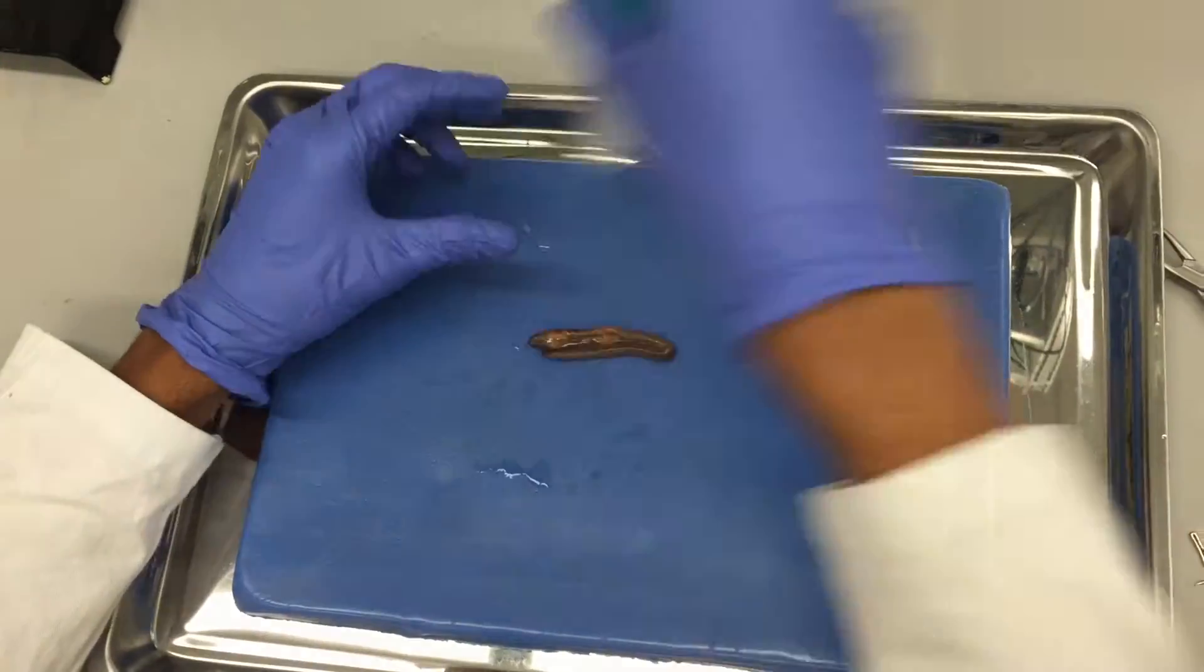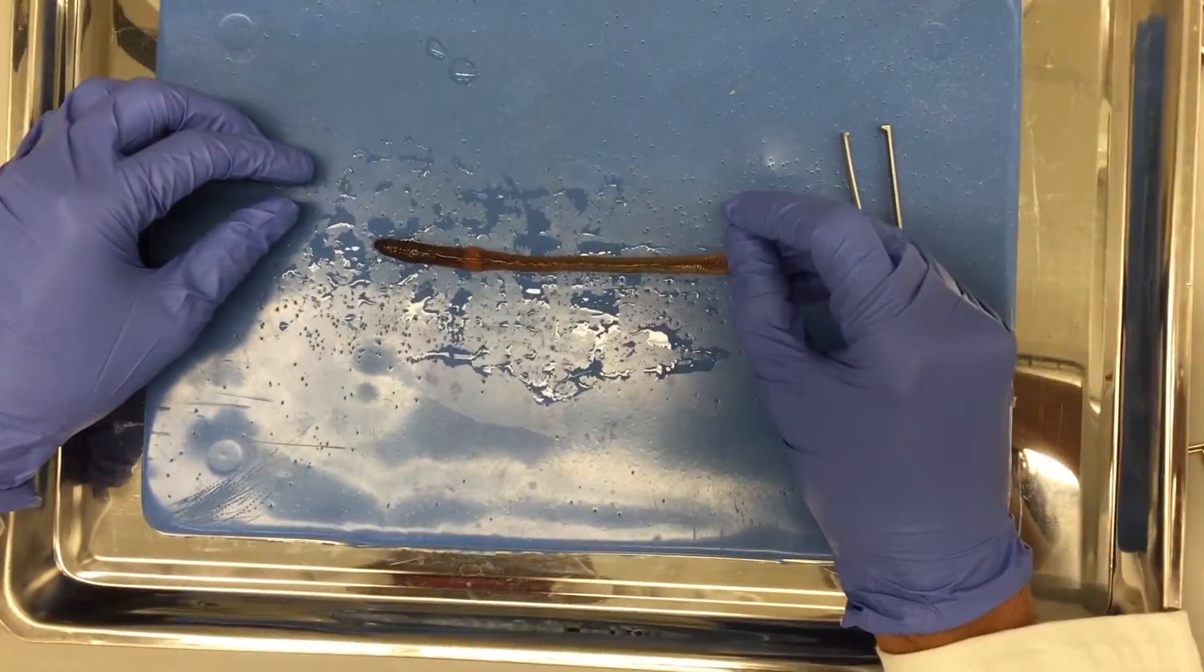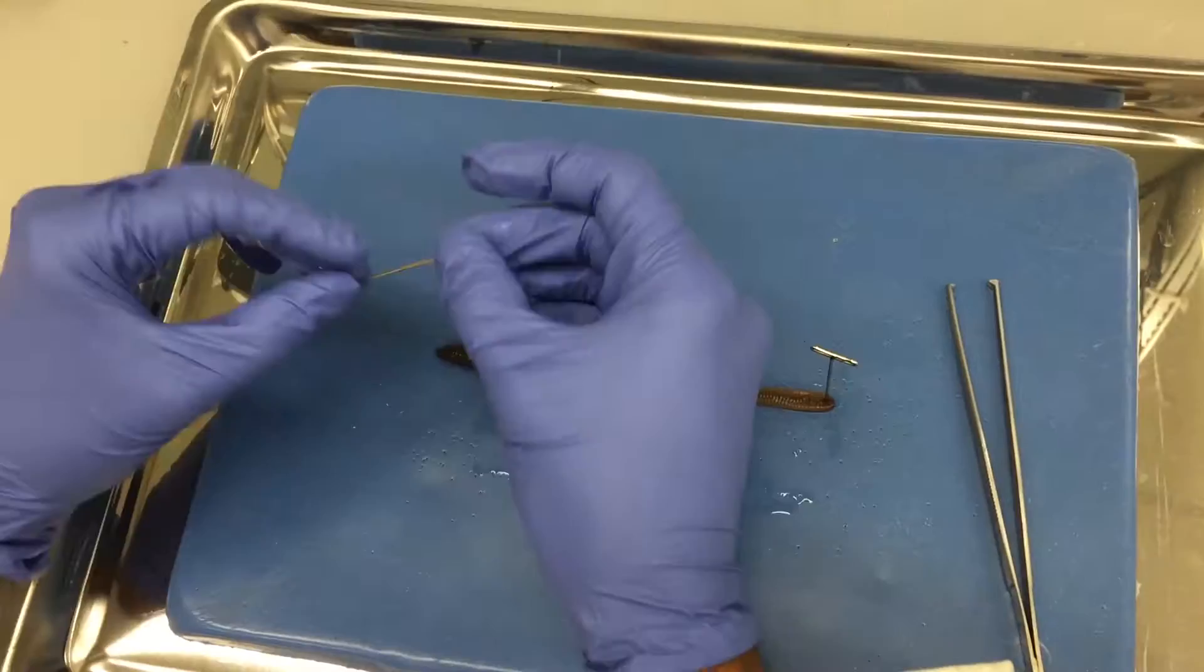Once you take out the worm, you will lay it dorsal side up. Stretch it out so that it is straight and pin it down at either end.